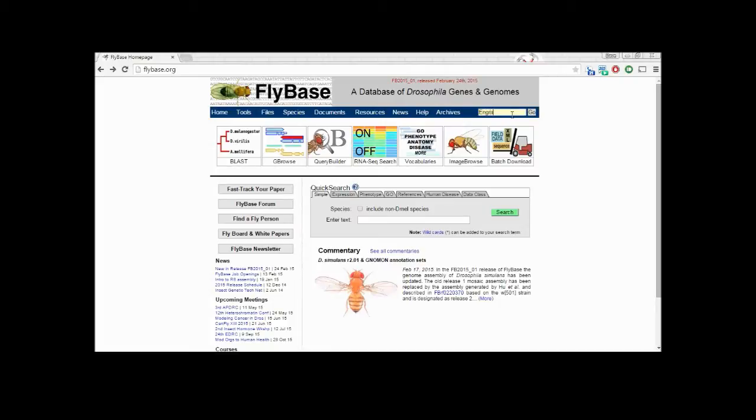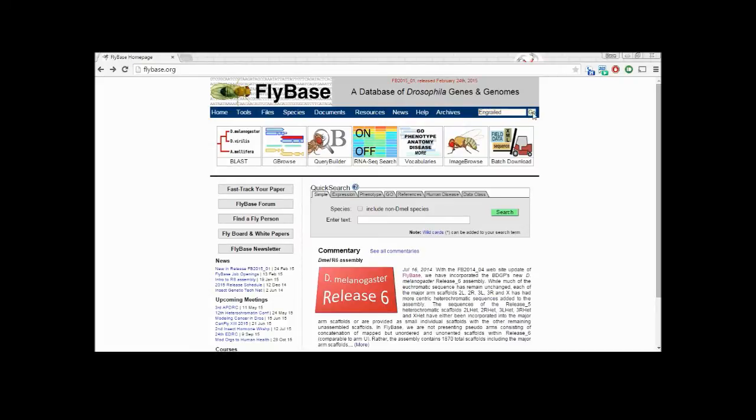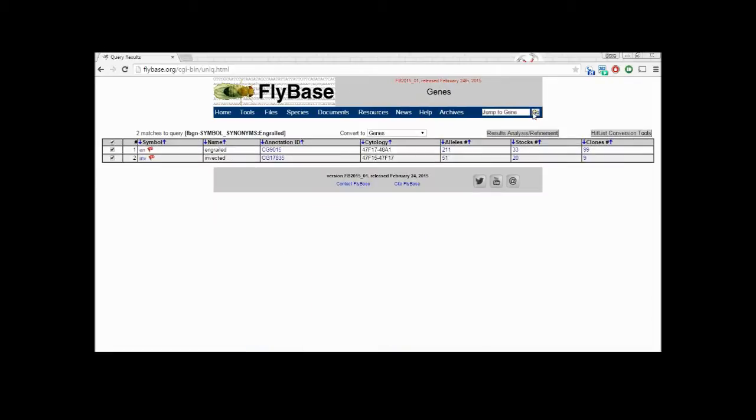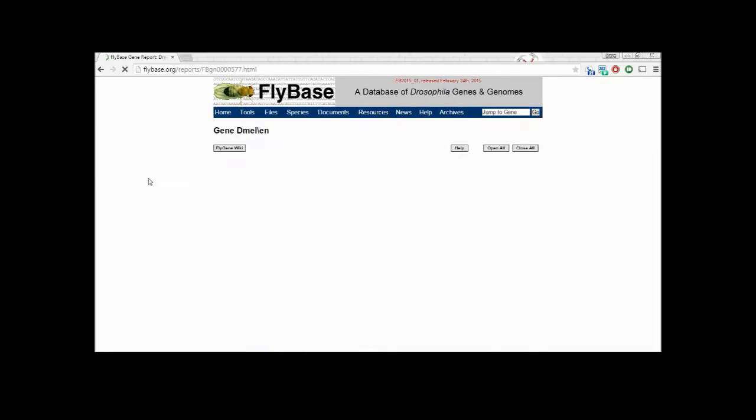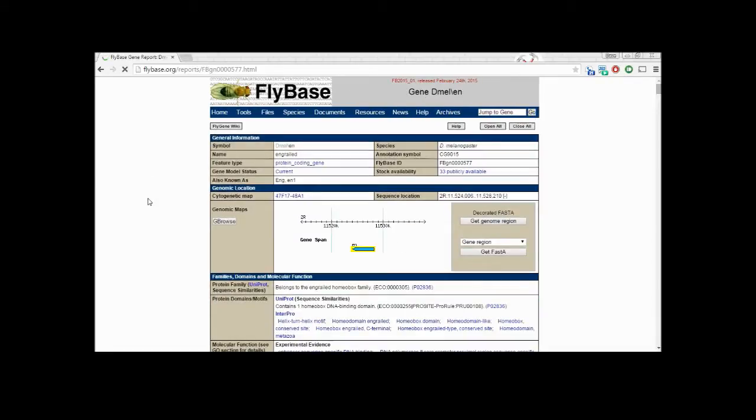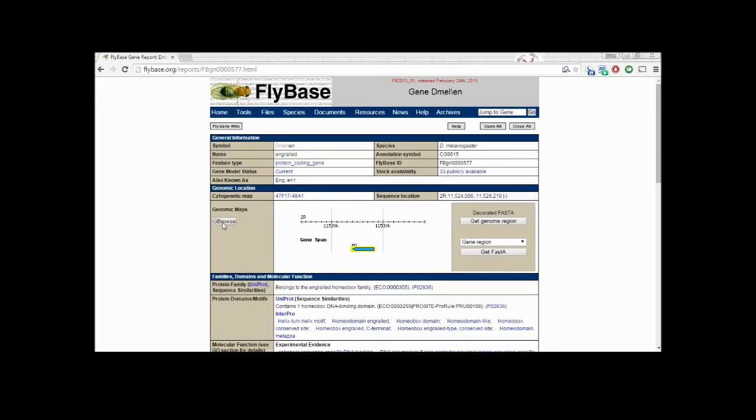We can begin by looking at the gene associated with our Gal4 driver. In this case, we are using the transcription factor ENGRAILED. Clicking on the gene brings us to a summary page. From here, we can click on GBrowse to see the gene as it stands in the genome.